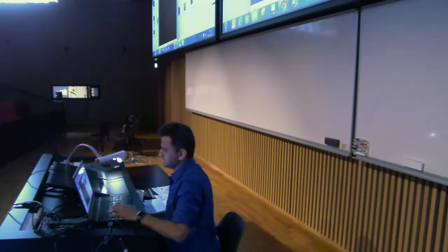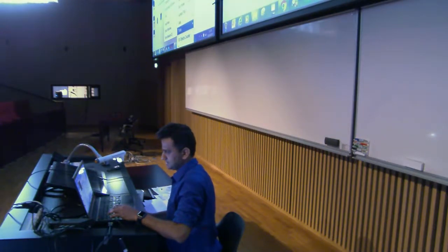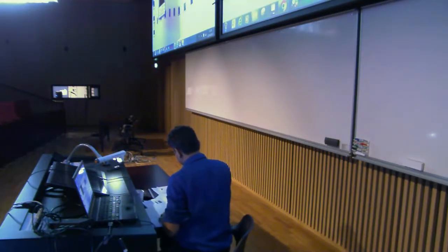Okay, what's that? Stack. What else? Analyze, label, set. Spot tools. I think we have covered everything now, and then set measurements, distributions. Good. Plugins. I just quickly want to show you the bleaching correction, and if you want to quantify what is happening. So just give me 2 minutes. I'll just go through the notes and see what is remaining.